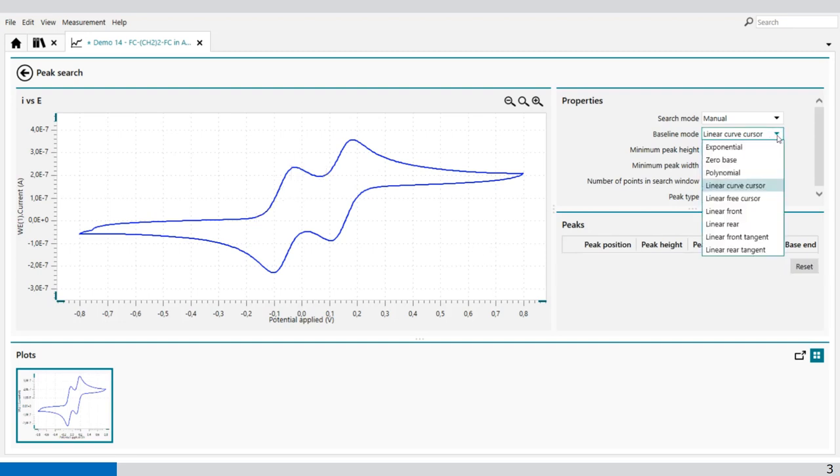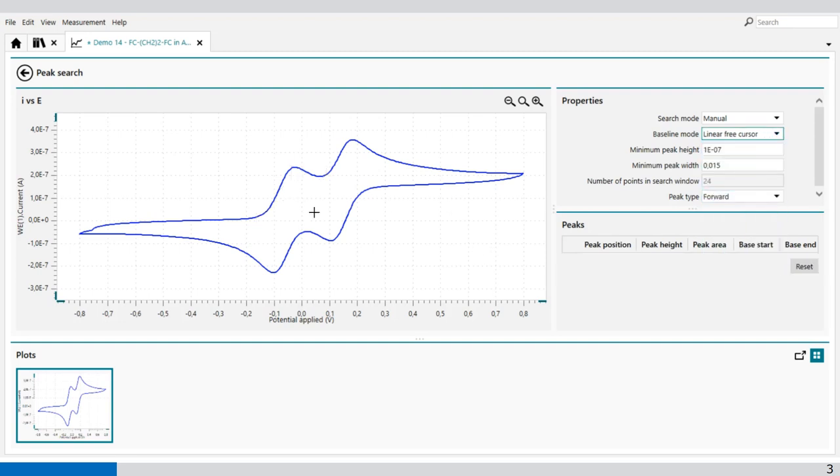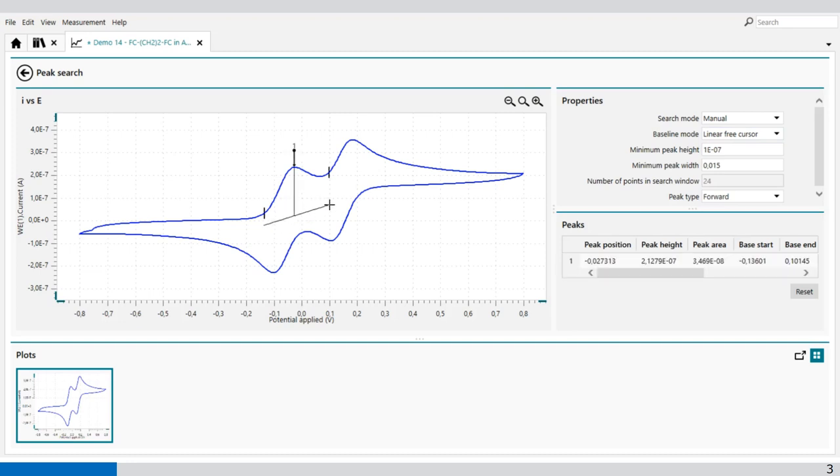Then we have the linear free cursor. Here you can select anywhere in the plot. You can select the baseline. It gives you the peak position, the peak height, and the peak area.